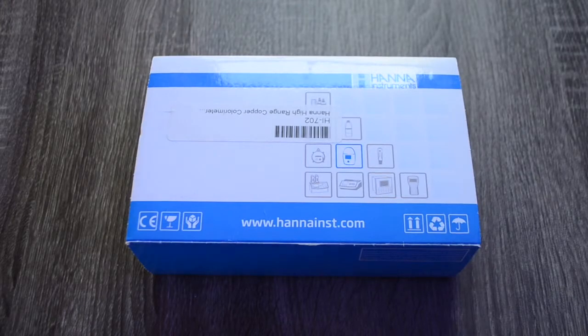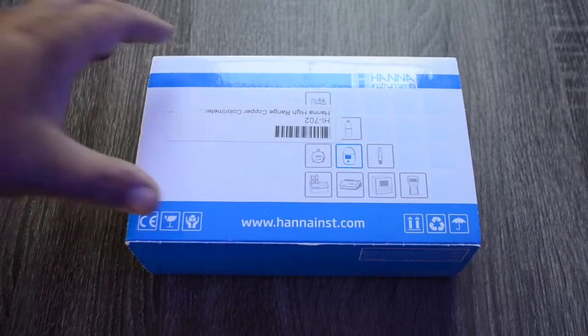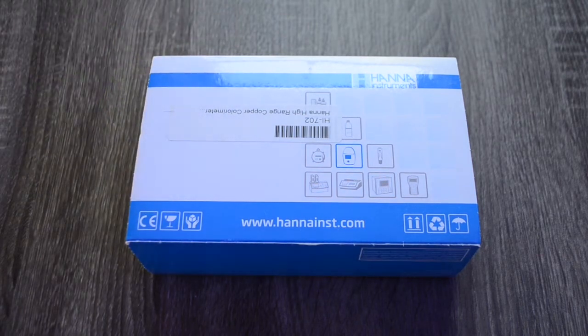We're taking a look at the Hanna high range copper color meter from Hanna Instruments. If you aren't familiar with Hanna checkers, they are essentially a device that reads parameters of the water for you. There are a couple of different steps involved with each individual checker, but this one is going to be checking high range copper.